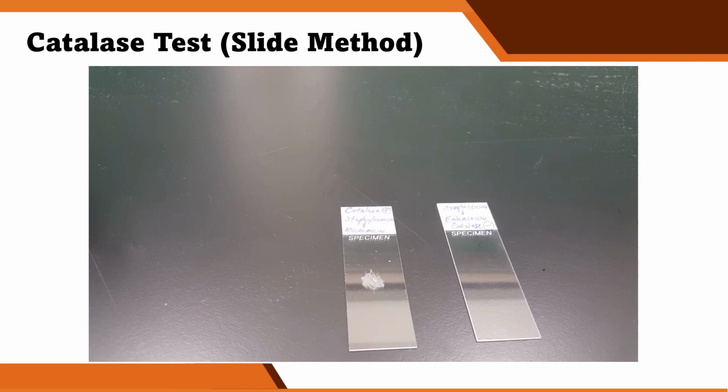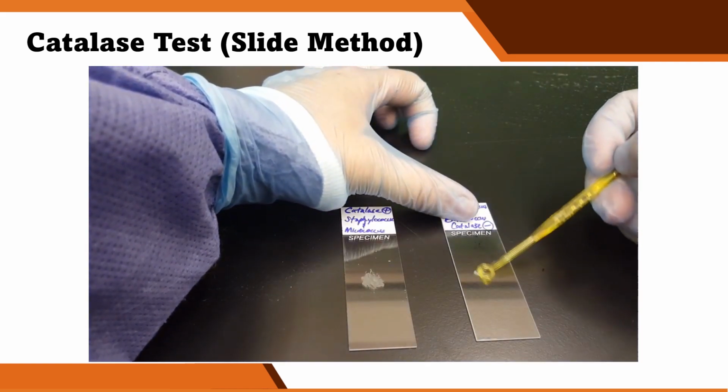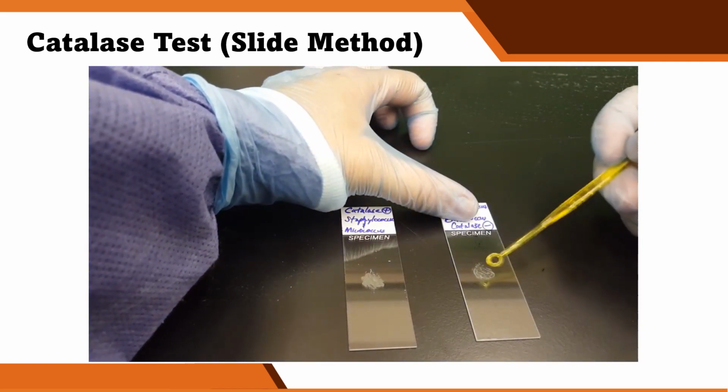So what I did was I labeled the organisms out of the first grouping of organisms we use in class, which are positive, and those that are negative in regard to gram-positive cocci. So we have the Staphylococcus and the Micrococcus that should be positive, and the Enterococcus and the Streptococcus, which should be catalase negative. Now, if you look at the gram scheme of things, most everything is catalase positive except for Strep and Enterococcus.